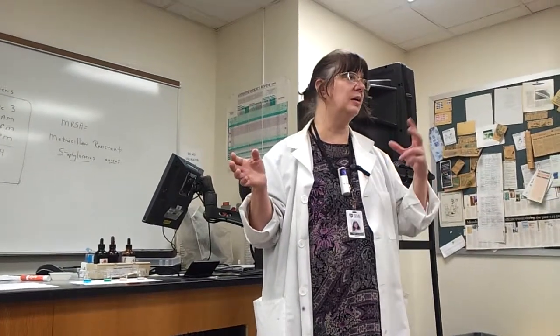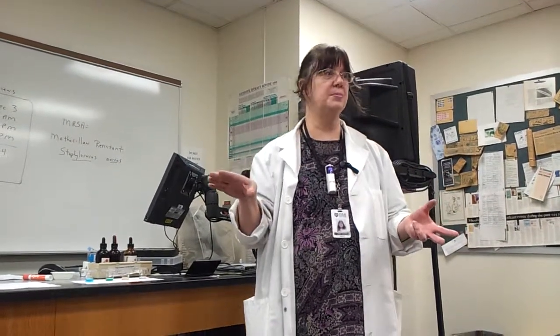If I have a plate and it's red, it's a positive lactose fermenter, what could be the organism? E. coli. If I have a plate and it's straw colored with no color on MacConkey's, it would be Proteus. If I have a plate with a metallic green sheen, E. coli. And that's just the way it goes. It's what it says. Red means positive lactose fermentation. Colorless or off color, anything but red or pink or anything related, no lactose fermentation. That's it.